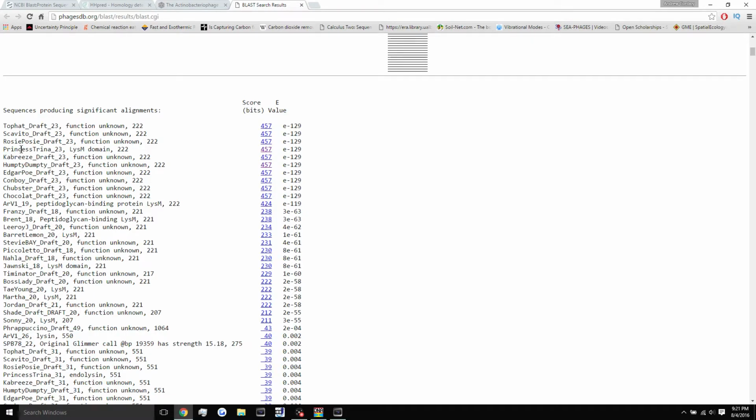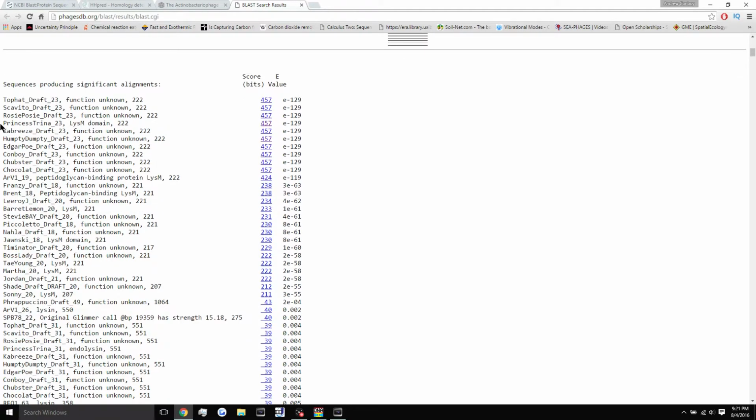If you guys remember, that was actually the phage that we copied into the BLAST section from our BLAST results as well. So you could put the same phage result in twice. I generally try to avoid it because if you listed this in the BLAST results section, and then you list it again in the Phagesdb section, it's kind of redundant. You already listed this phage gene as evidence, so it's not really worth putting in. However, like I said, you can choose to use it if it is some more information that you think would be interesting for the quality control people.